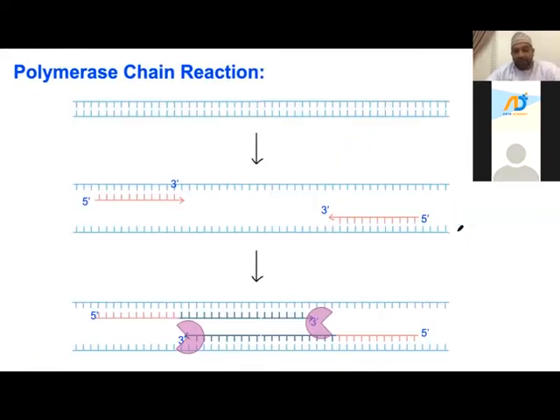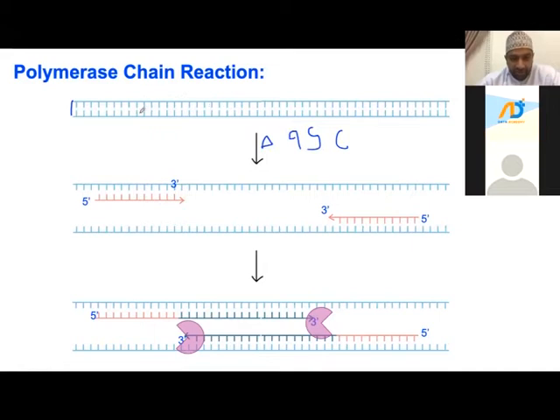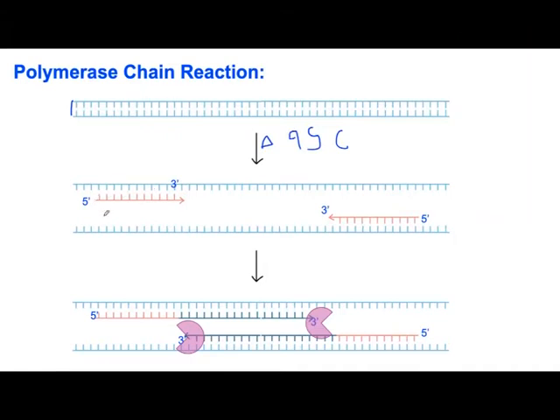So this is the PCR. Now, how to do a PCR? If this is your double-strand DNA molecule, the first step, you need to heat it up. You increase the temperature to around 95, because at this temperature the hydrogen bonds between the 2 strands will be broken, and then you're going to get the 2 strands separate. And then you need to add these 2 selection tools, which we call the primers. So the forward primer, and then you have the reverse primer. You need to design them. There is software, you can do it manually, but nowadays software can do it much easier and faster for you.